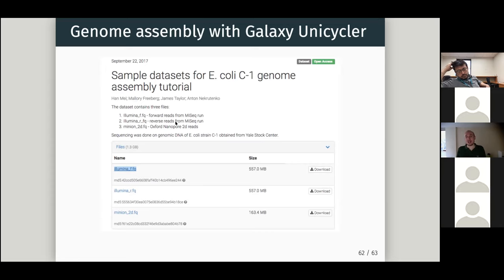And this is, again, E. coli assembly, but not with HiFi. This is taking longer. That's why I'm not proposing to do it. It's actually a hybrid assembly, so it's using Illumina reads and also some MinION, the device that Olivier showed you before, some nanopore reads for scaffolding, for closing the gaps. So this is probably answering to some extent the question that your colleague had. I don't know how nasty your particular bacteria was, but this is exactly the same thing.